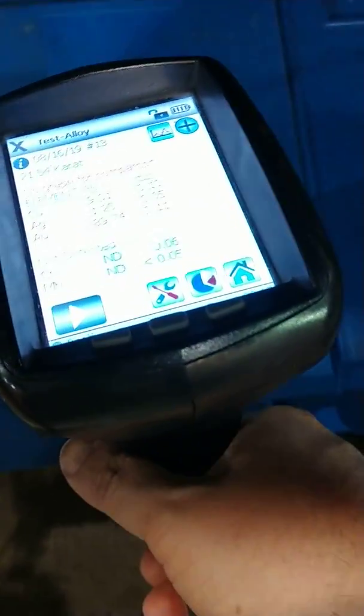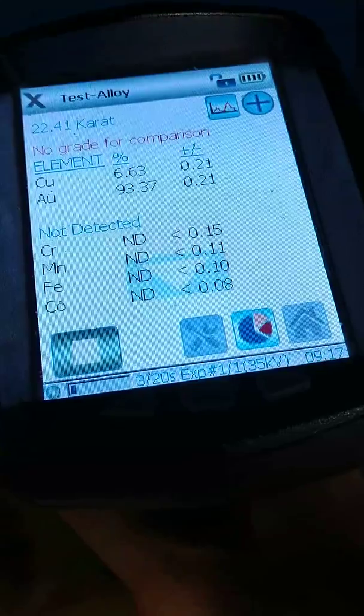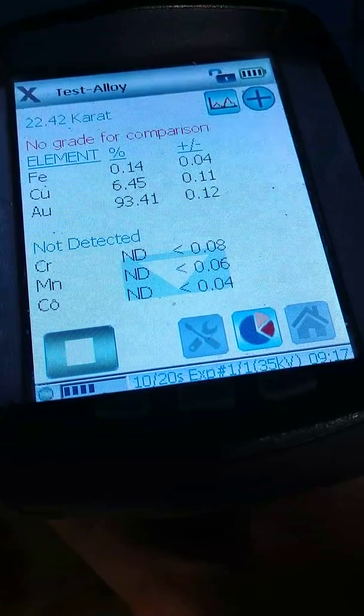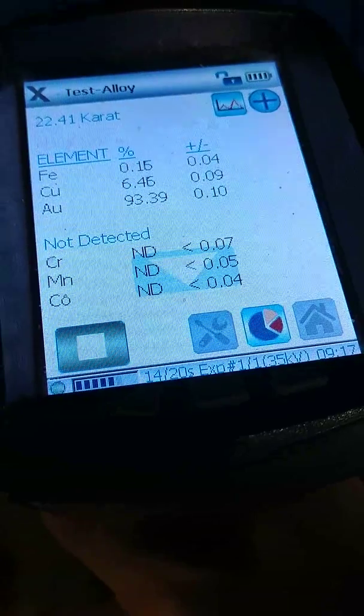The next one here is one of the Lebanese counterfeits. And look at that — it's too rich. The reason is they made so much money selling them as counterfeits that it didn't matter what the gold content was. If it was higher, they didn't care, so they went ahead and did it higher.